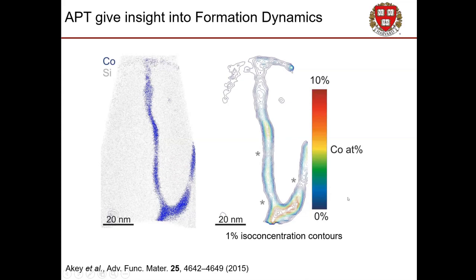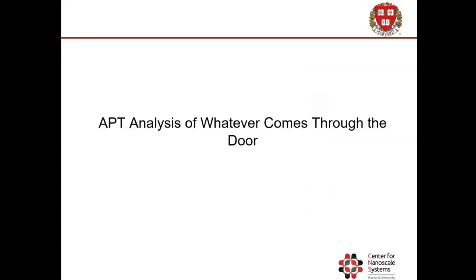All quite intriguing. It's a case where Atom Probe gives us the ability to look in depth into a very unusual material about which very little was known, that was formed through the result of both small scale and fast time processes. And the sensitivity of Atom Probe is sufficient that we can actually start to say something about those processes from these data sets.